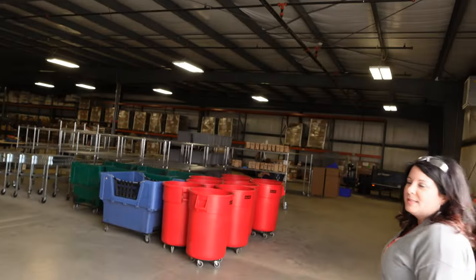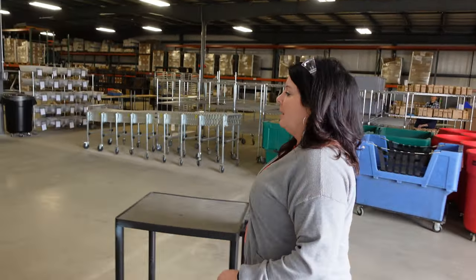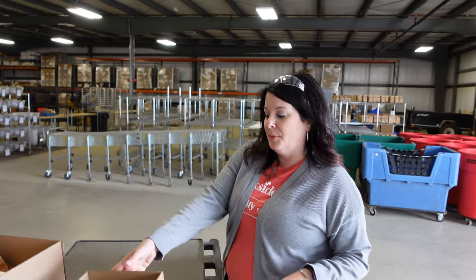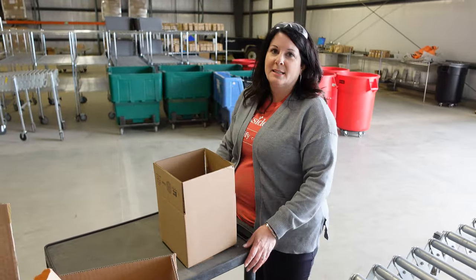Samples are received daily at Brookside. They come out here on the conveyor belt. Technicians from the appropriate labs will come out and collect the samples. These are soil samples. We'll place them on our cart and head into the unpacking room.